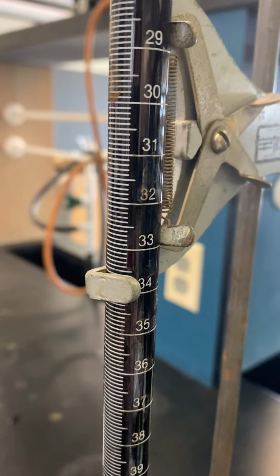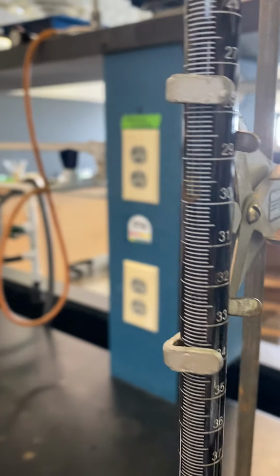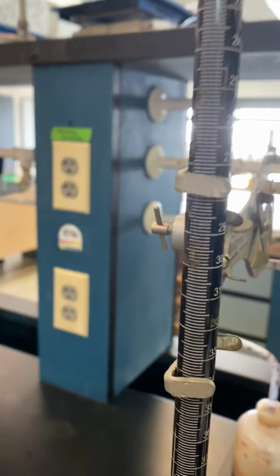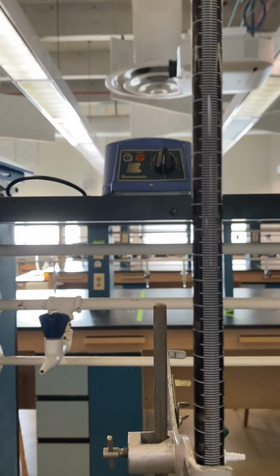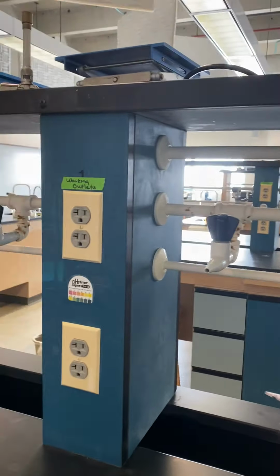Okay, this is very much important because we always must record using the right precision of the tool that we have in the lab. Okay, so I am super short, so I'm going to have to move our burette down to my level, or maybe I can climb up on a stool. Let me grab a stool.